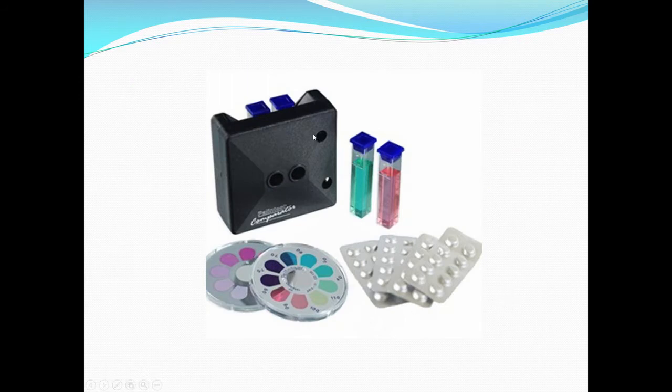You can see the black box contains two cells, which I have shown on the right side, and the filters are fixed inside at the bottom in a round plate.